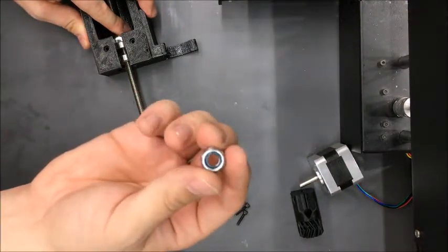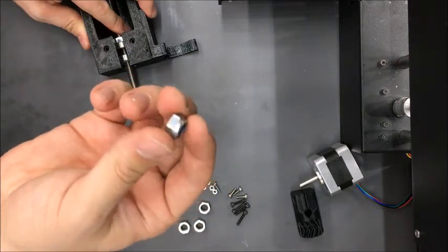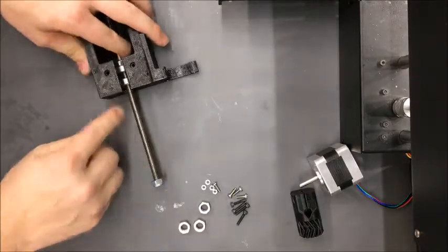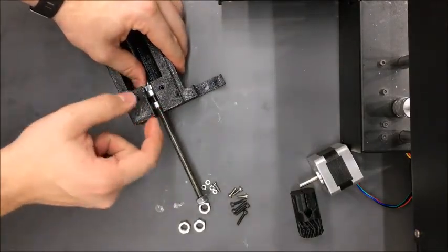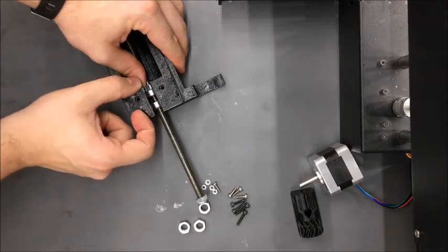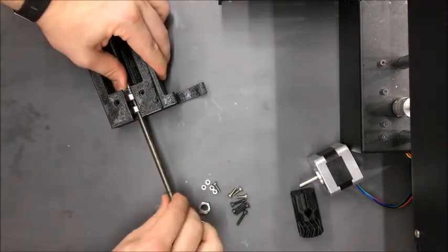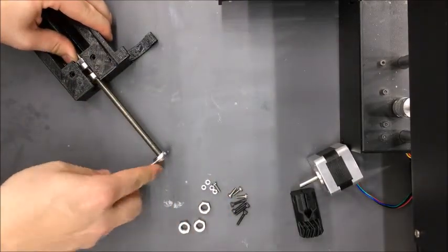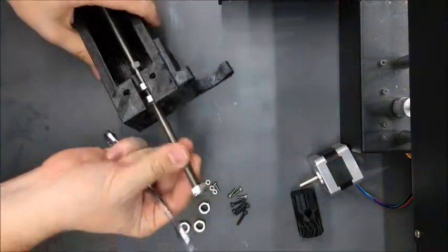The next thing is to put a lock nut on the back of the lead screw to clamp it into the bearings and secure it so it can't slide back and forth. You can use a lock nut with a nylon ring inside, or a regular nut with a little bit of Loctite. These lock nuts are great though. These are really difficult to put on — you're going to need significant physical strength.